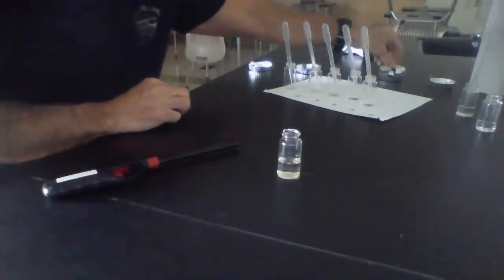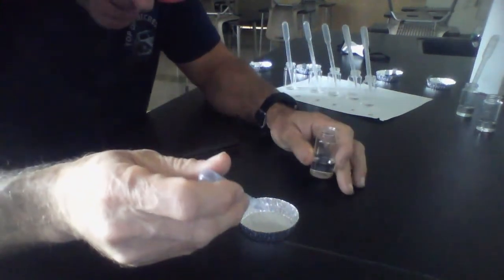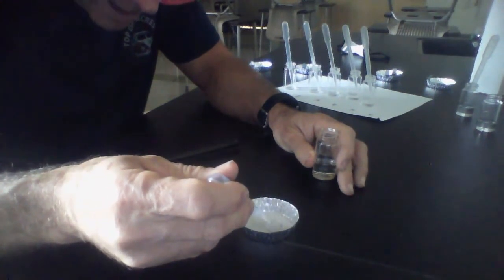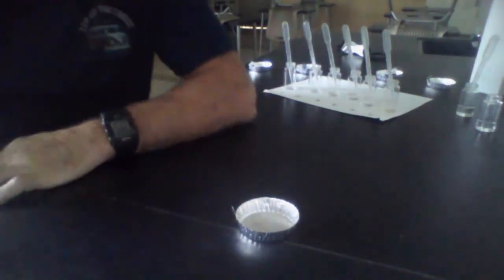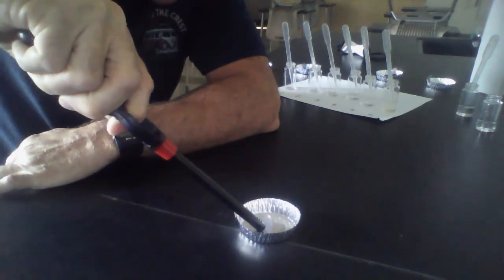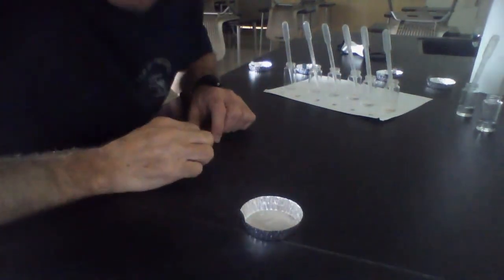Yeah, you're welcome. Okay, we have 1 to go. And 5 drops. I think I could guess what it's going to do. Can you? 1, 2, 3, 4, 5, 6. I'm observing that it is beading up like crazy. Scientists call that a high contact angle. And 3, 2, 1, ignite. And as I suspected, I can't get this stuff to light. Nothing, nothing, nothing. We're going to go with non-flammable.